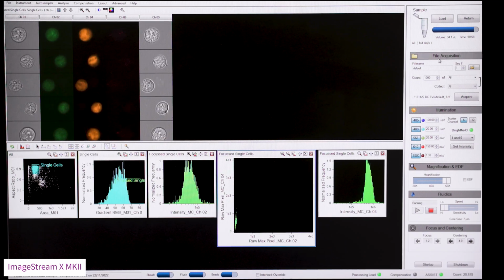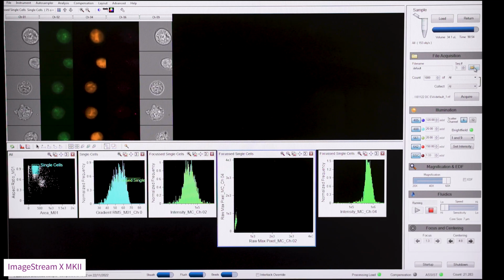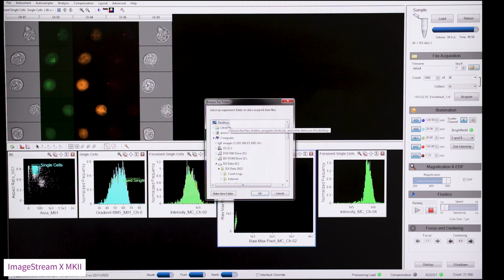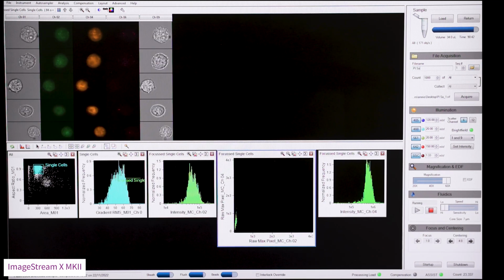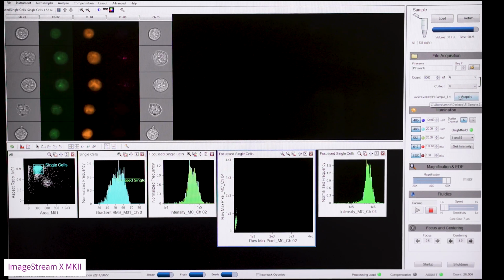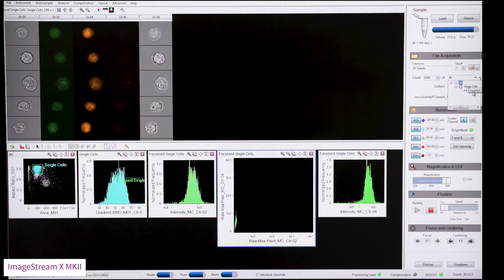All our settings are now complete. We can acquire our data. Start in File Acquisition, select where the data is to be saved. Change the name. Choose how many cells to count. Here, let's say 5,000 cells, and we can use our focused single cell gate.